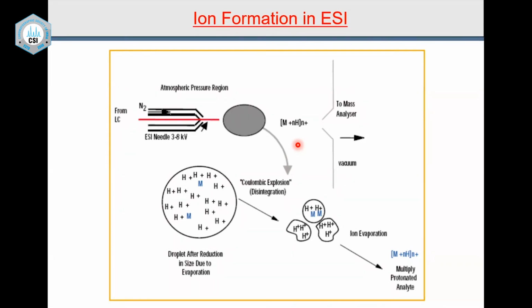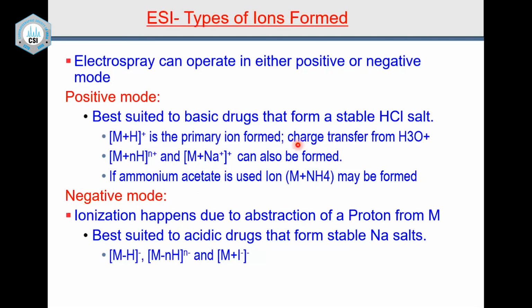How to analyze a multiple charged ion is a separate beast. I'll explain to you. So first let me explain to people about the low molecular weight compounds, where generally it becomes M plus H, that is a molecular ion plus 1. So you get an M plus 1 ion. So this is the solution chemistry. Very, very important for you to know.